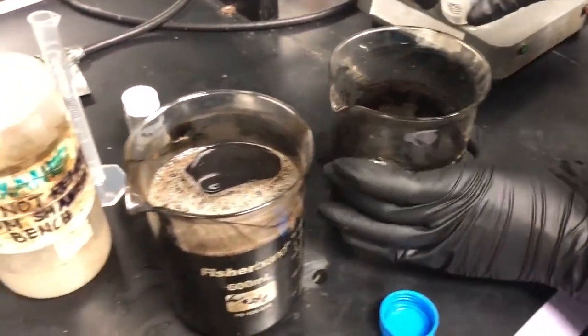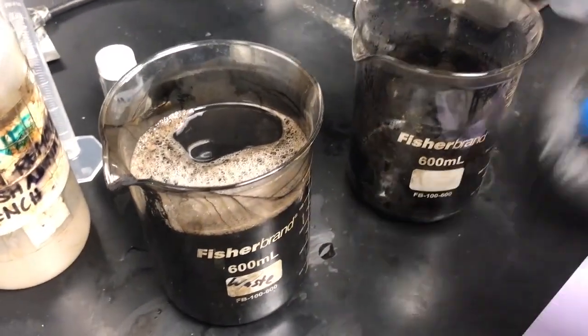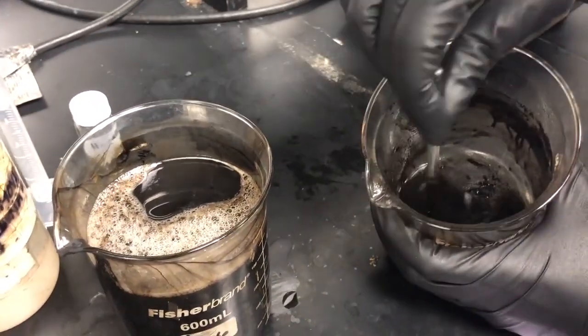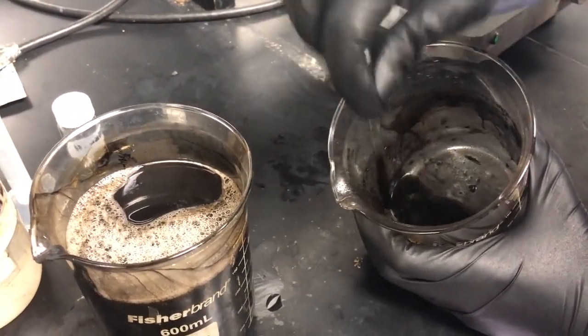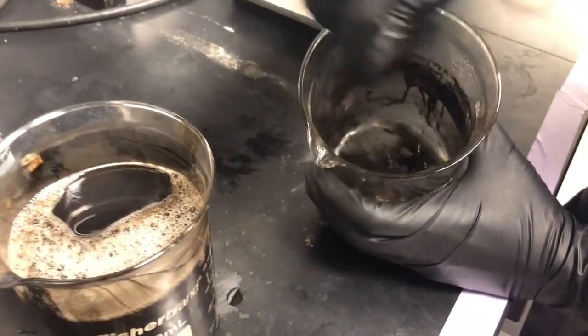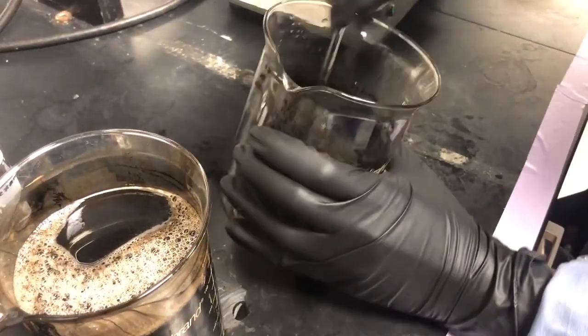Now, one thing to note, we have been using the same waste beaker here at UCLA, but it is encouraged that you separate out your water from your ethanol and hexane. So use waste 1 and 2. Again, follow the procedure exactly as written. This video is cutting some corners to make it a little bit faster and a little bit simpler for educational purposes.